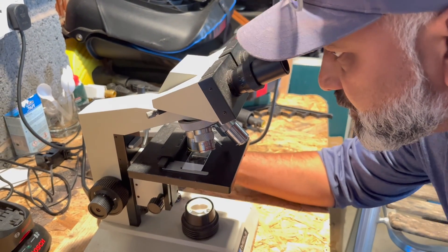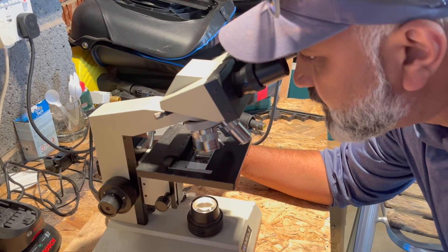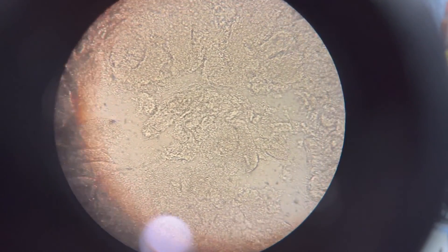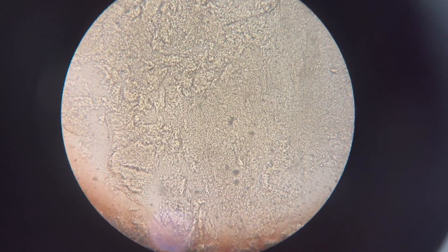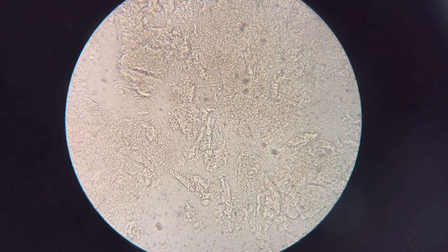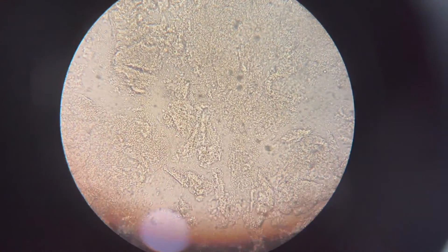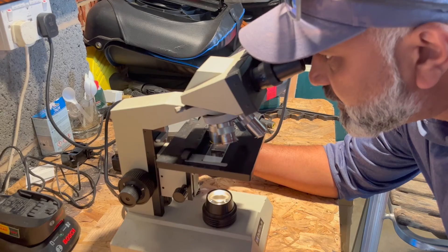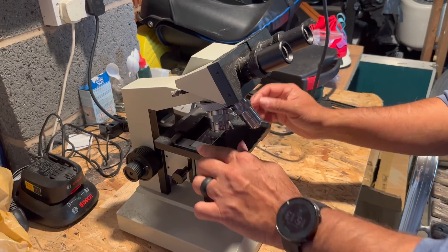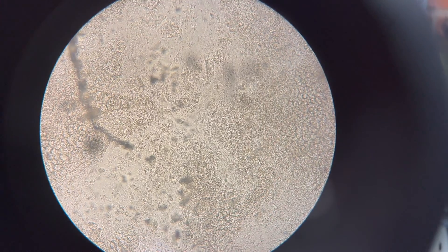Now we're going to put our sample under the microscope and see if we find any parasites. I'm taking my time, looking through the slide properly. In any areas where I see dark shadows or something I'm not sure about, I use the focus to look through the mucus layer. It's all clear, so we're going on to the next slide.